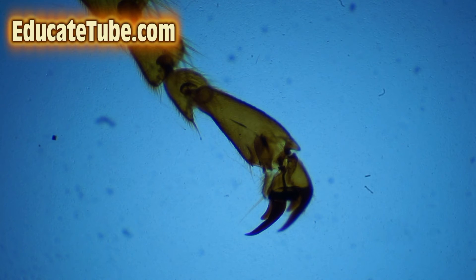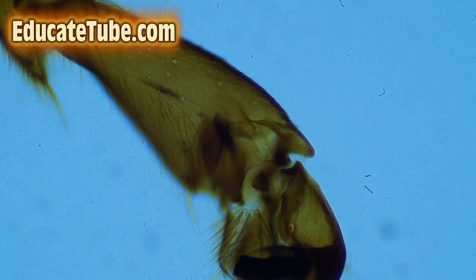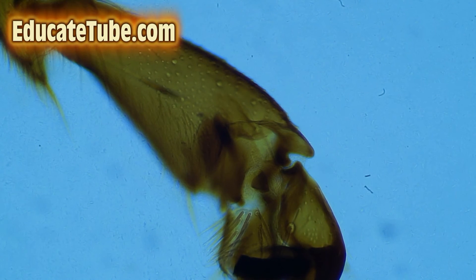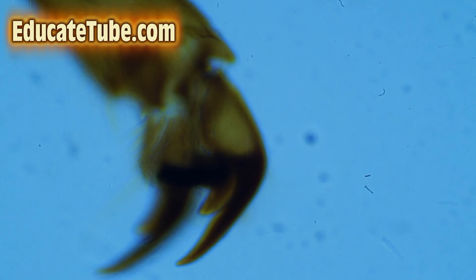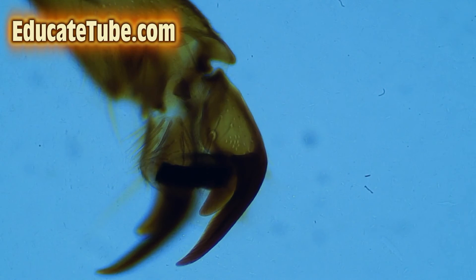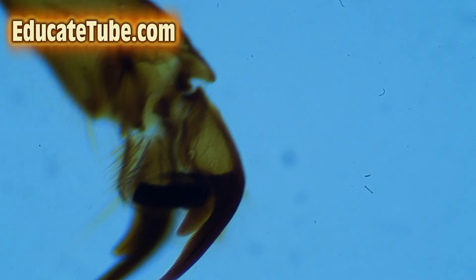If you're inspired to become an entomologist, or want your kids to be, a good start is to give them a microscope. Now we are zooming in thirty times — you can see the claw up close at thirty times, four claws, and notice the fine hair-like structure along the claws.